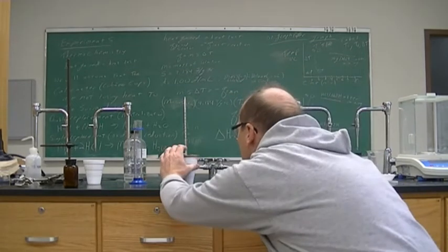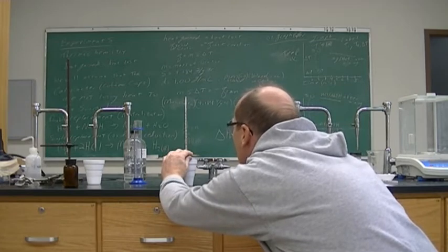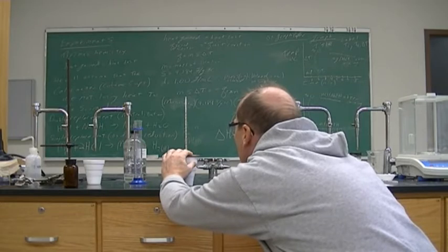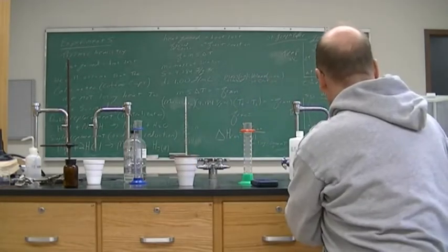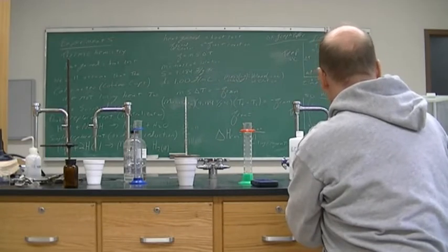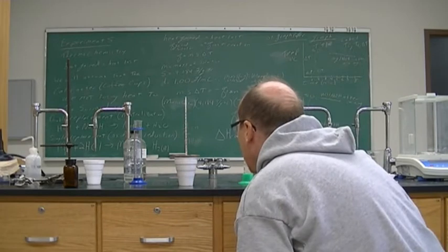Up on the 2 minute mark, it is still at 24.0. So it has not moved at all from the 1 minute mark to the 2 minute mark.